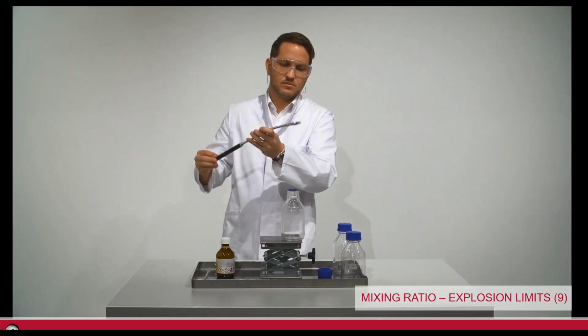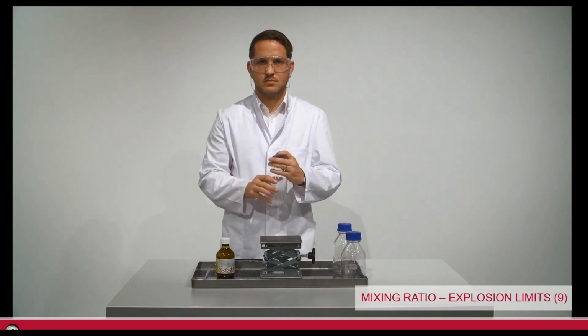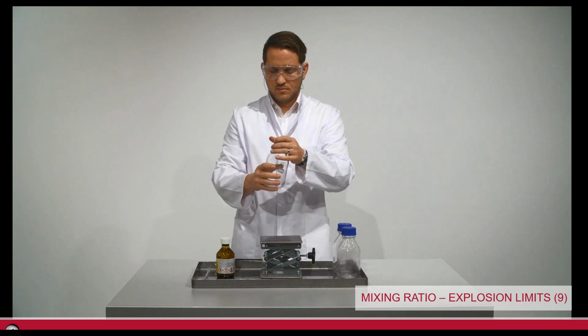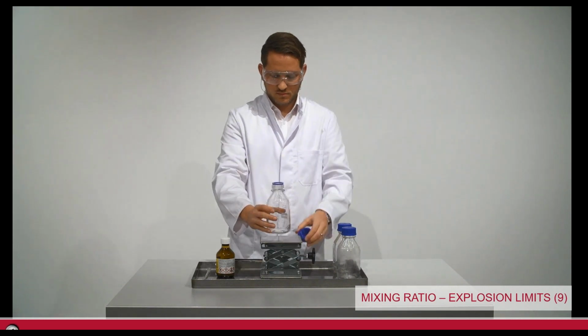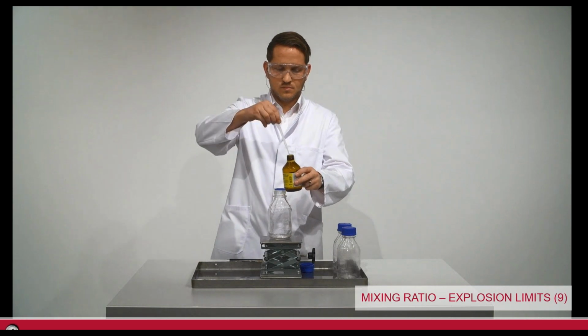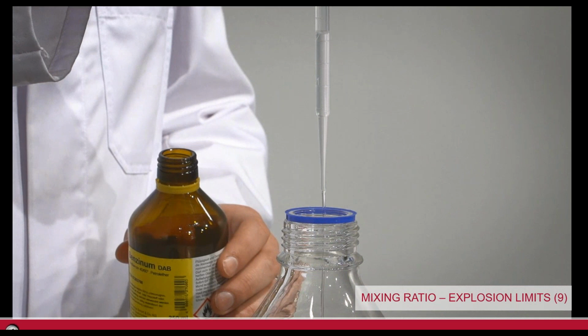Just the opposite. So, really the point behind that is, guys, it doesn't take too many chemicals in the vapors. The reason I tell you this is ventilation is extremely important. Your air changes in your lab space, your air changes in your buildings, air changes in the cabinets are all extremely important. So let's see how far we can really take that. So put 10 drops in.